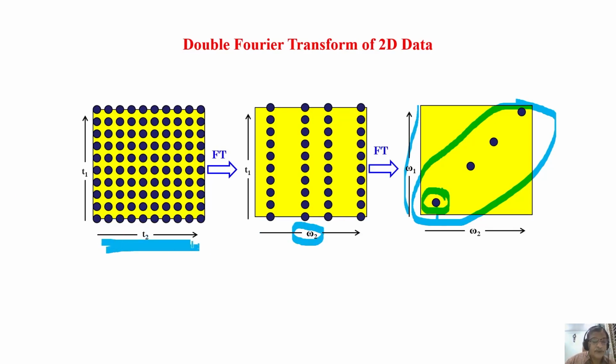It is called the F2 dimension. Similarly, this is called the F1 dimension, T1 dimension, or omega 1 dimension. Since we detect the signal directly, it is called the direct dimension. This is where we are acquiring signal indirectly, so it is called the indirect dimension. These are the nomenclatures which are adopted and you most often come across in the textbooks and literature. Please don't get confused. Everything is the same. It's only the way we use it.